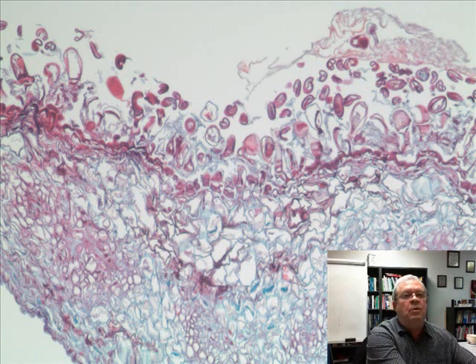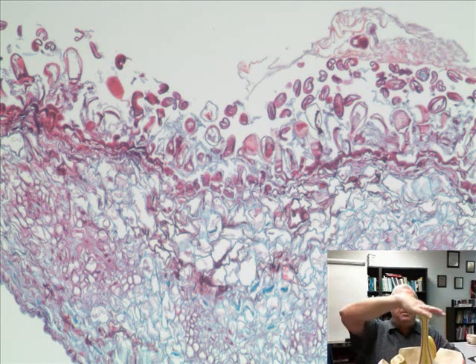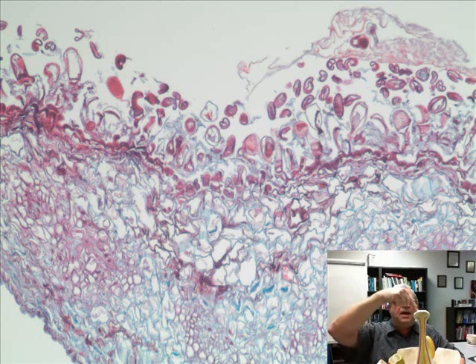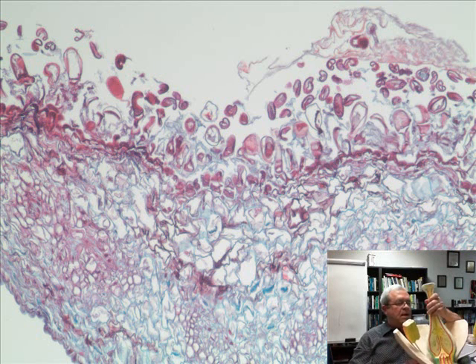What in the world are we looking at? Well, let's look at our model here. We are on the rooftop. Up here, what is this called up here? The stigma. The stigma. And this series of slides will take us down a little bit into this part here. What's this called right here? The what? The style. Stigma, style. And actually we're going to kind of come around the right side of the stigma down to the style where it narrows back down. Stigma, style. Let's see how this works.